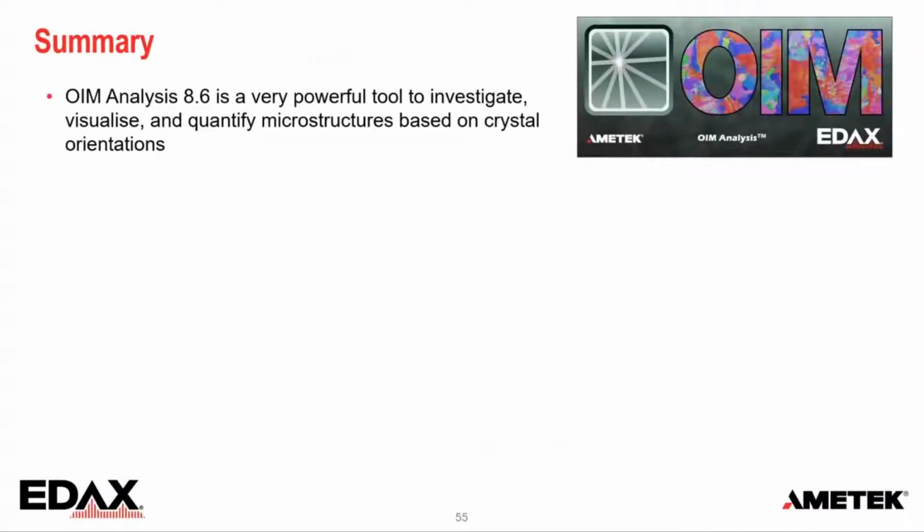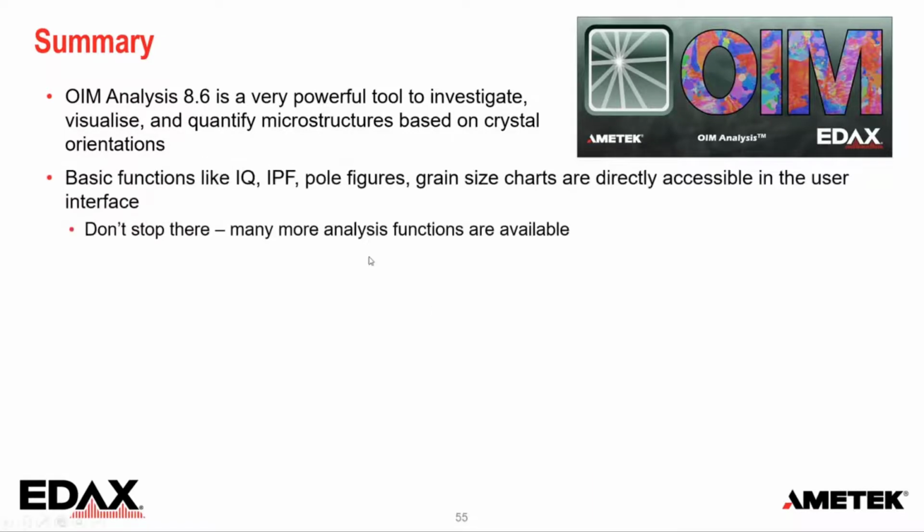So just to summarize that, it's an extremely powerful tool to investigate your materials, visualize them, quantify them, everything based on the crystal orientations. A lot of the basic functions are just directly available by single mouse clicks, but there is much more below the surface.